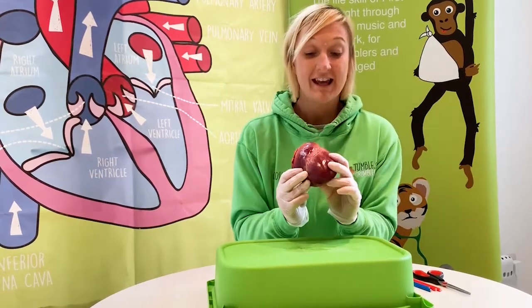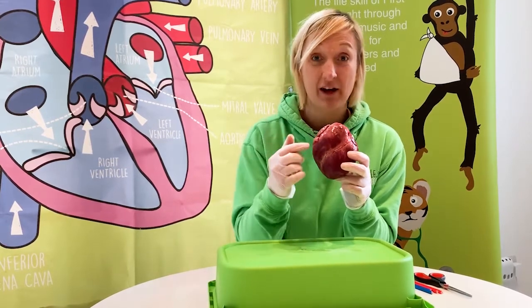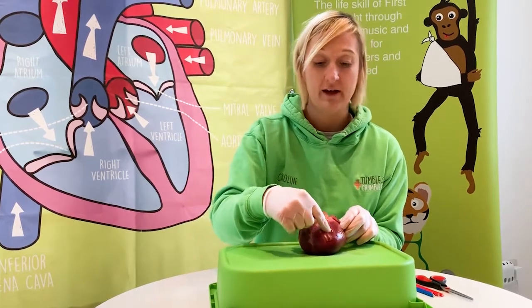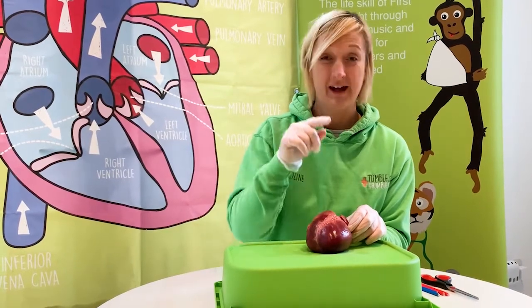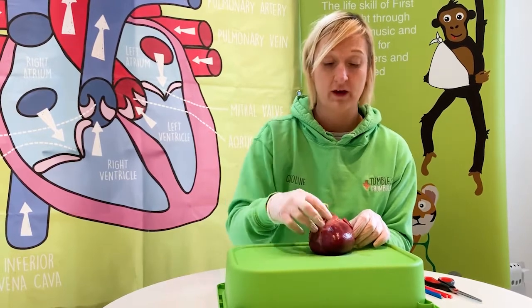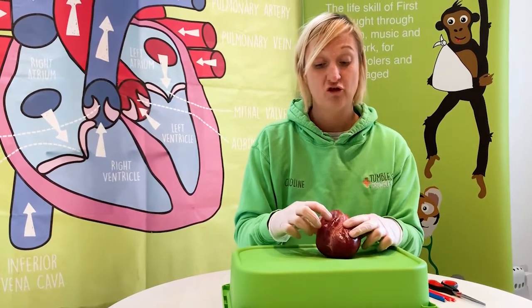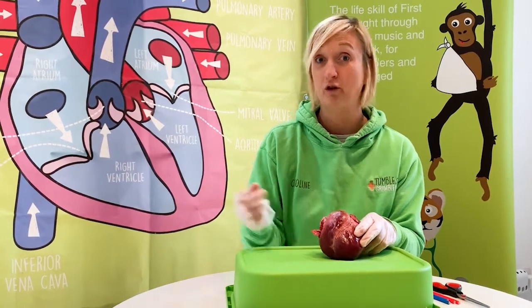So, here is the heart, and we are going to decide which side is the left side of the heart and which side is the right, okay? I'm going to lay it on here. And can you remember which side is the thickest and the strongest? Yeah, it's the left, isn't it? So I'm going to have a feel of this side, feel of this side. And this side, which is my left, as you guys are looking at it, it'll be your right. But this is the left side of the heart, and it is definitely the strongest. This side's pretty strong too, but the right side isn't as strong, because remember, the right side only sends the blood up to the lungs.